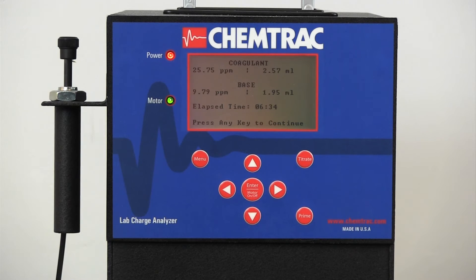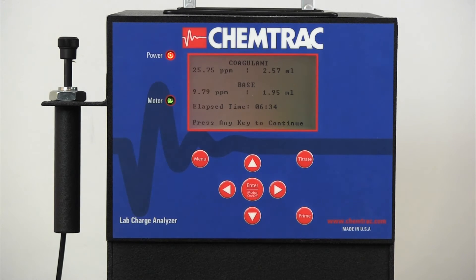Upon completion of the test, the parts per million dosage results are displayed for both chemicals.